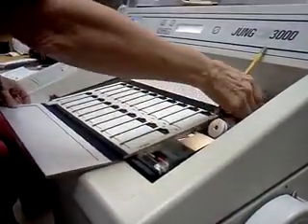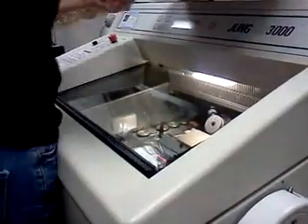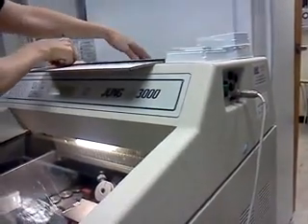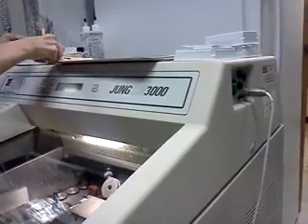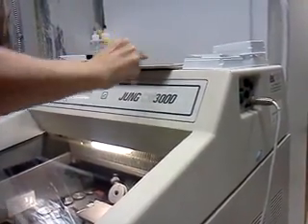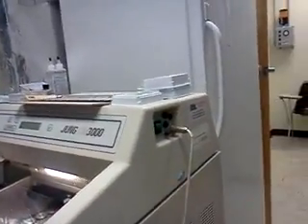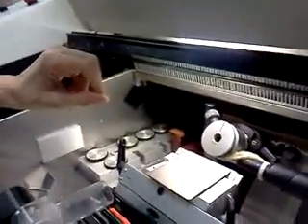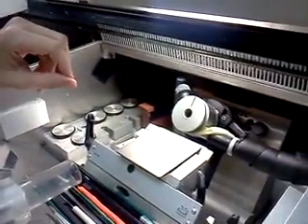So after you've made up your decision of what you're doing and how you're going to do it, you just can put that there, and then you're sitting here, got your slides all lined up there, going to be doing it. You can just grab your thing, you're going to cut, select, pop it there. Next one, boom. Next one, so you're all ready to go. That's how you do that.